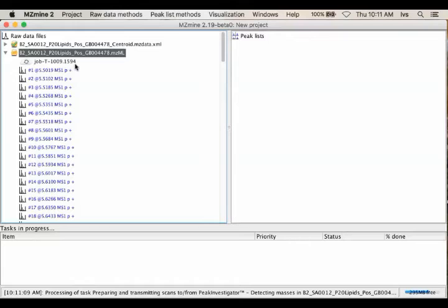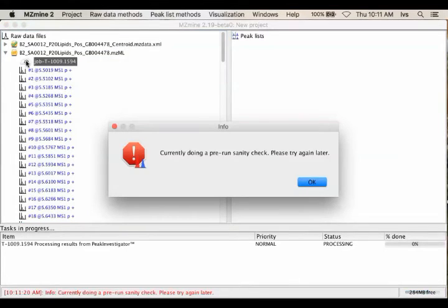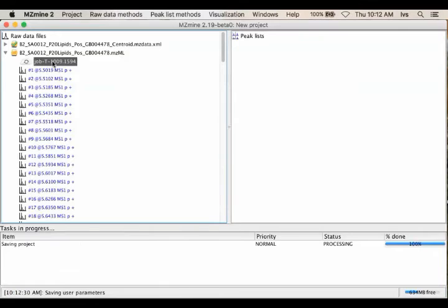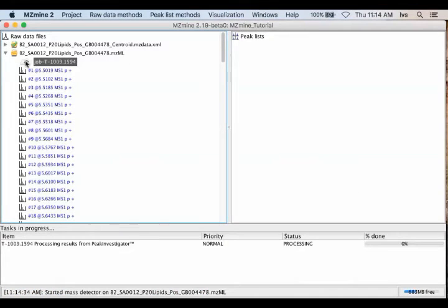It can take Peak Investigator 24 hours to process a job. We automatically scale a sufficient number of cores into our grid to complete the job within the targeted timescale. If PI hasn't completed processing your data, you will get a status message. The job is first pre-processed to ensure spectral data consistency, then the job is run. The appropriate job status message is displayed each time the server is queried.